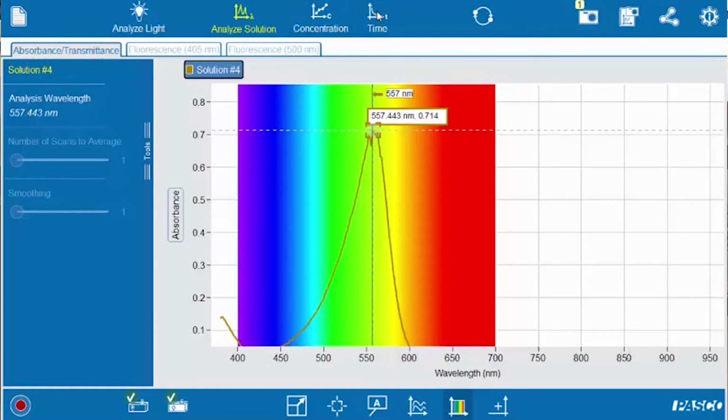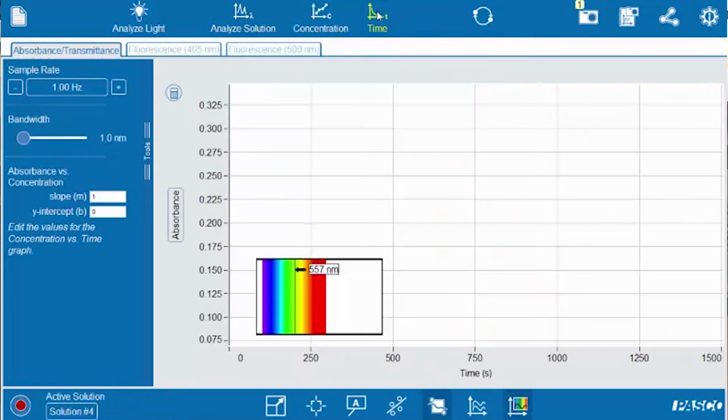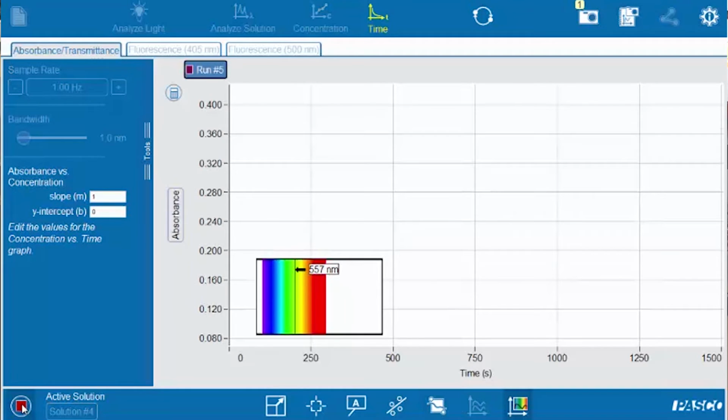Now what you need to do is go to the Analyze the Solution as a Function of Time button. So we have a new screen. You're going to hit play. This little rainbow icon just tells you that you're using that wavelength of 557 nanometers that you set. So we're going to press play.